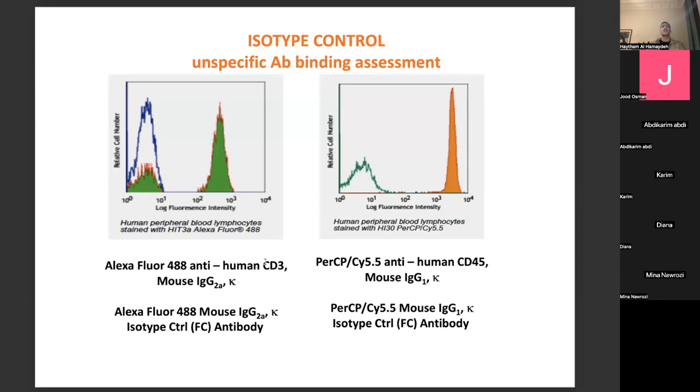Now when I tell you to put the antibodies in the solution that has those cells, what we think is that this antibody will only bind this way. But it cannot, because it also has the other region, which can bind to other things. When the number of cells bound to the specific antibodies is, let's say, 50, are we sure that all of our antibodies bound this way? No, it can bind this way too. So those specific antibodies are not really specific, because the FC region is also functional.